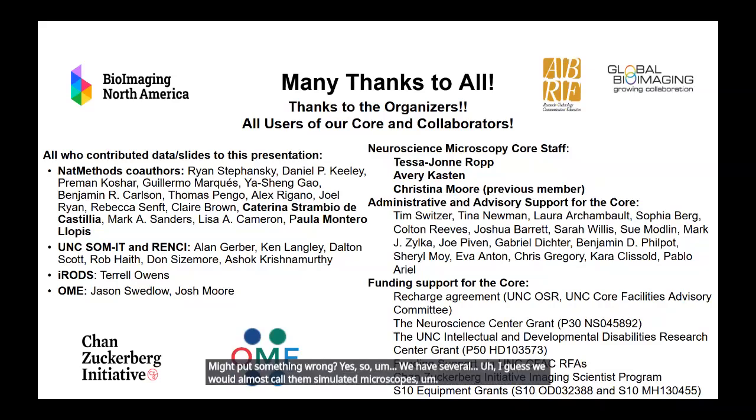And those have been very powerful for teaching people digital pathology, and how the optics defines the image, and enabling them then to become early entry analysts, without access to the hardware right there. So that's where the imaging use case has been: if they can understand how the image is formed using a kind of simulated image or microscope, then they can analyze them in a better way. And so that has been used more for education and then for trying to link tools.